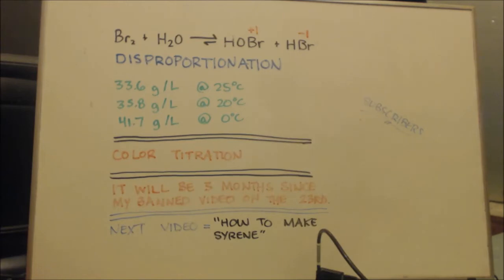But I have an idea of how much is in there, you know what I mean? And then I would use that to get a volume that I need, that's close to what I need. And then when I do the actual experiment, I can just color titrate. When it stops turning clear and it remains red, the experiment is over. The reaction is over. Okay?